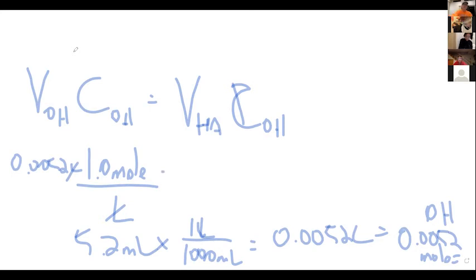So what was the volume of acetic acid you measured out? What was the mass, first of all? Mass of acetic acid in grams. Sorry, I'm sorting through my chicken scratch here. Sorry, quick question. Because it's a 1-to-1 ratio, the moles of the base is the same as the moles of the acetic acid? That's right, 1-to-1 ratio.